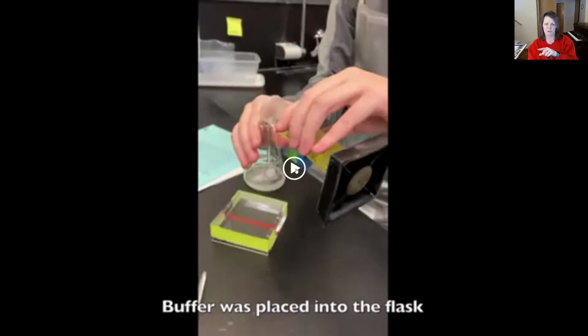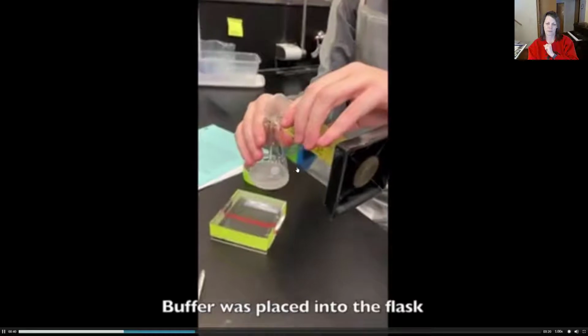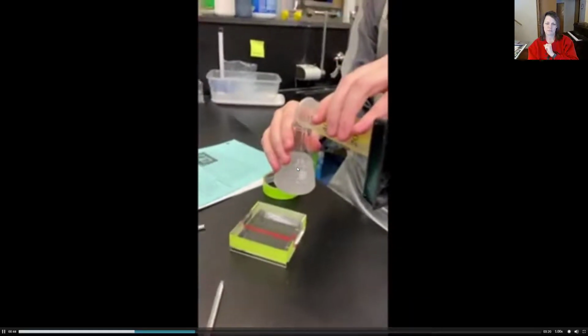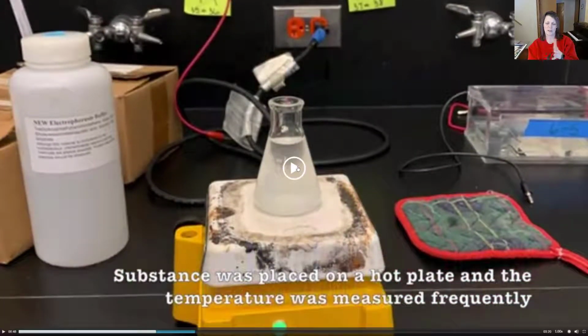Adding the buffer that you measured in the graduated cylinder into the flask that has your agarose. This mixture needs to be heated on the hot plate so that all of the agarose powder can be dissolved completely in the buffer.